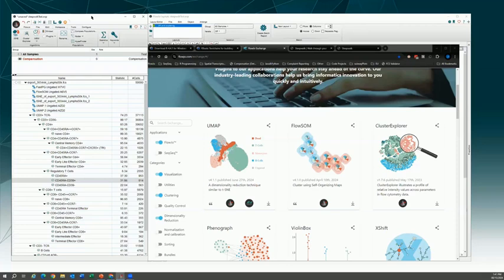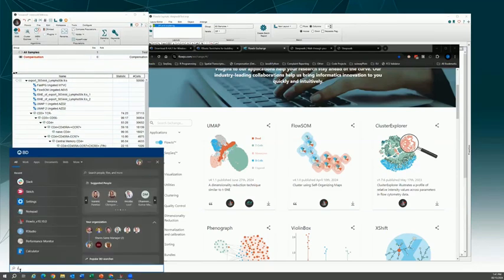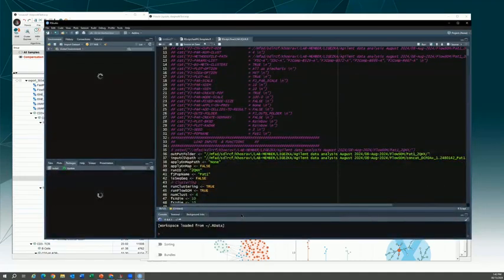One other tip, if you have a very fresh install of R, is to go ahead and try to install an R package, because you might get a prompt on your machine if it's the very first time installing a package.